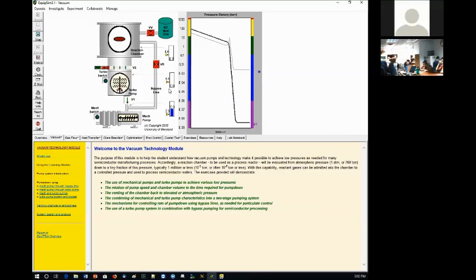Okay, that's it. That's the point. So this is the point. We now know the crossover point. It's around 1 torr. That's the crossover of the turbo. The turbo actually starts working there. So before that crossover, it doesn't work. It says I'm too loaded. Don't make me work. My blades will hurt.